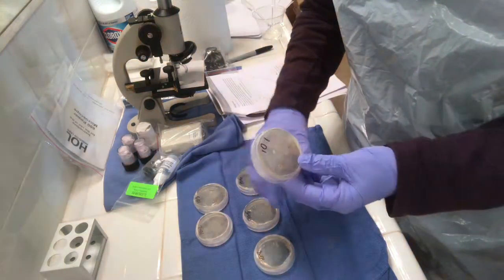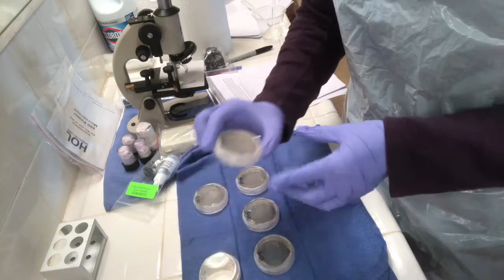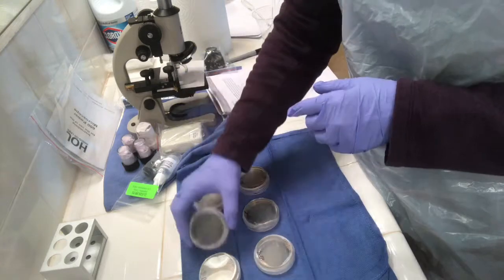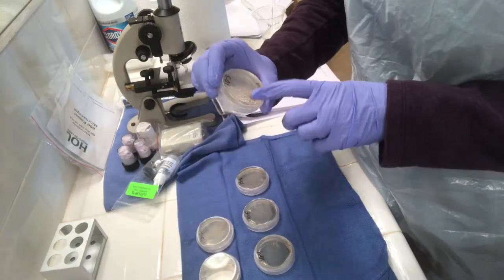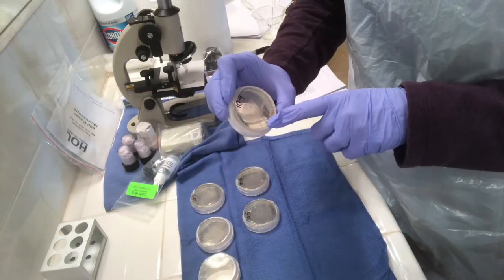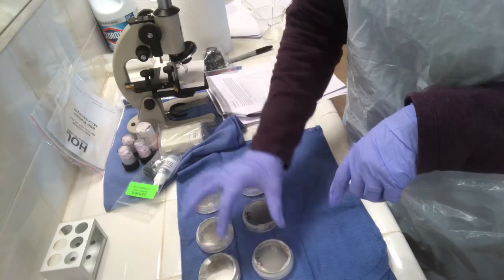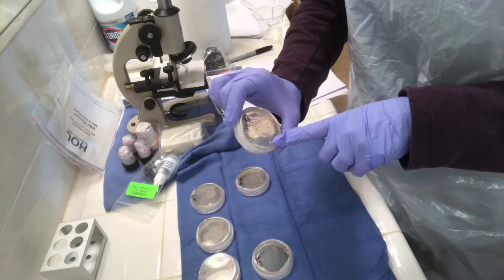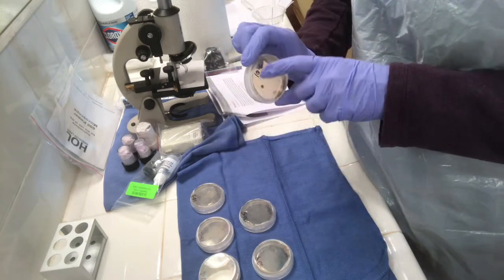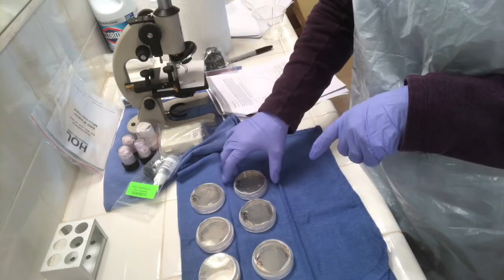So this is 10 to the 1 for my solution. I have a couple of contaminated microbes, so I believe I have to be better with my aseptic technique. This is too many to count. Too many to count, and now it has some contaminated microbes. The third one, 10 to the 4, was still too many to count. I believe it was like 380. And then the 10 to the 5 was the next one that was a viable amount. And then 10 to the 6 has some microbes on here that were contaminated, but it was too few to count, so it was less than 30.